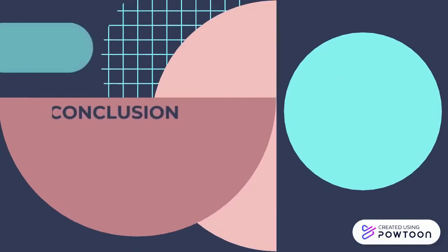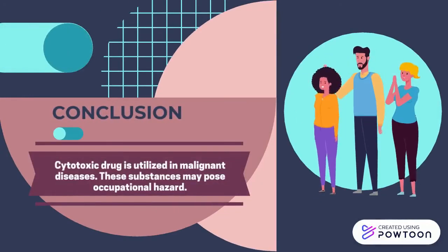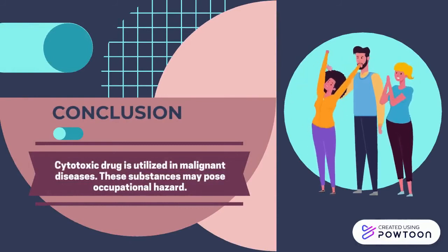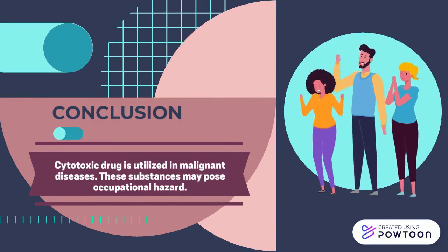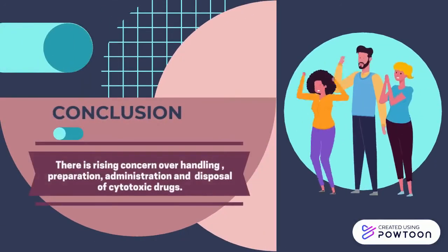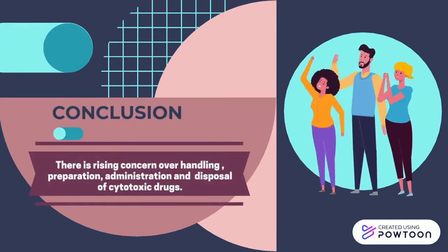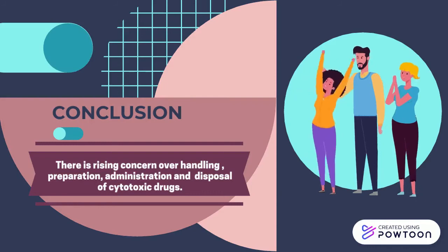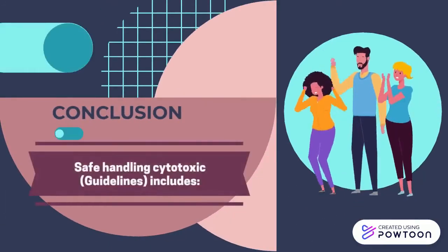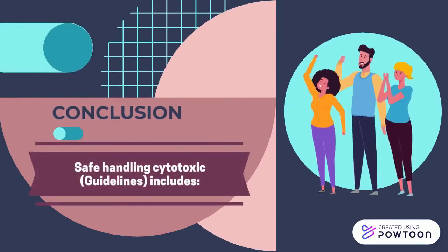In conclusion, cytotoxic drugs are utilized in malignant diseases. These substances may pose an occupational hazard. There is rising concern over handling, preparation, administration, and disposal of cytotoxic drugs. Now, let's move to safe handling cytotoxic guidelines.